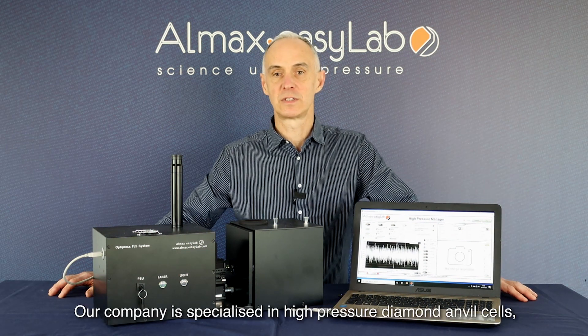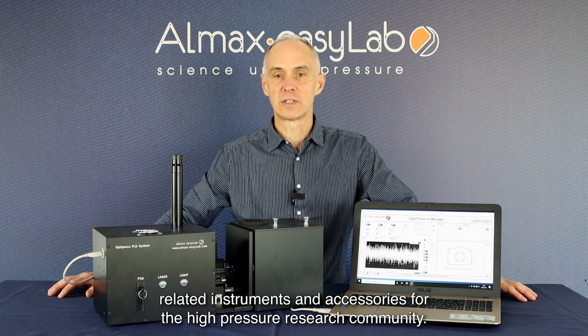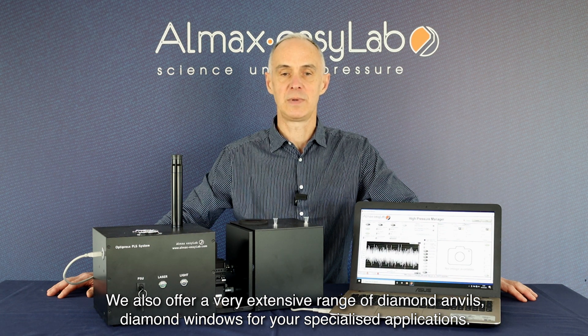Hello, my name is Christophe from Almax EasyLab. Our company is specialized in high-pressure diamond anvil cells, related instruments and accessories for the high-pressure research community. We also offer a very extensive range of diamond anvils and diamond windows for your specialized applications.